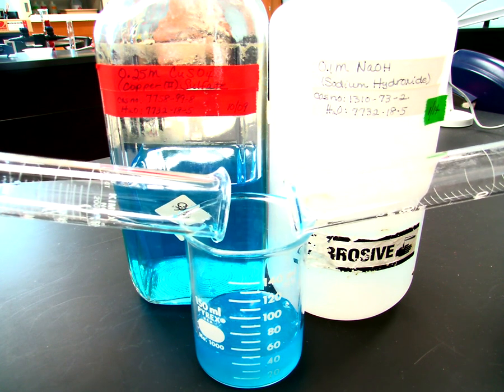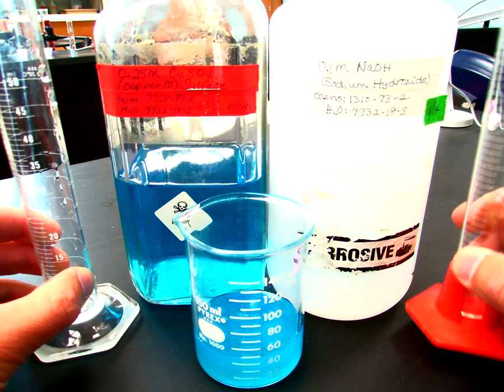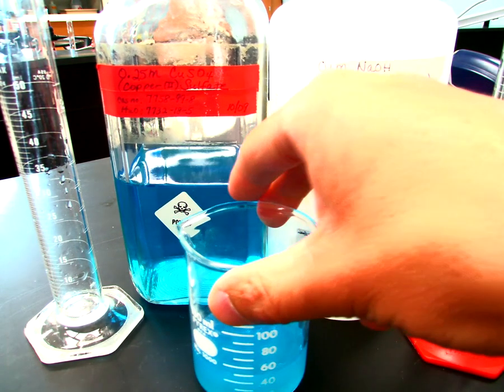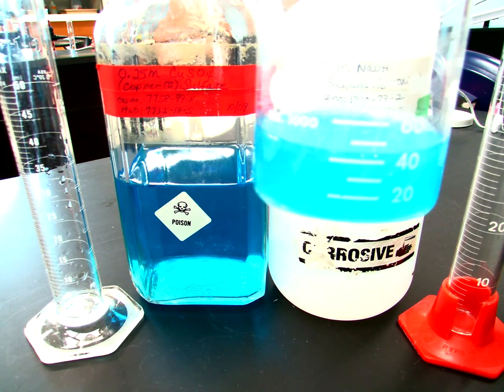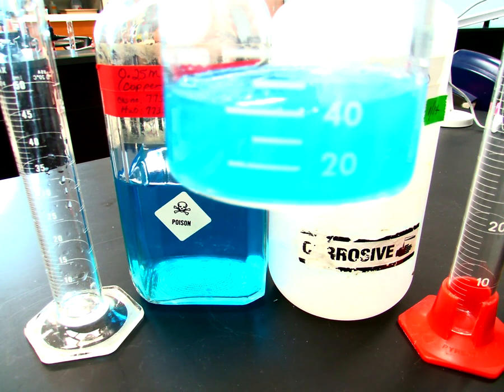that a precipitate forms. The whole point is to find the percent yield of the precipitate. So you're supposed to know how much you would make, and then you're going to be able to figure out how much you did make and do a comparison to find the percent yield.